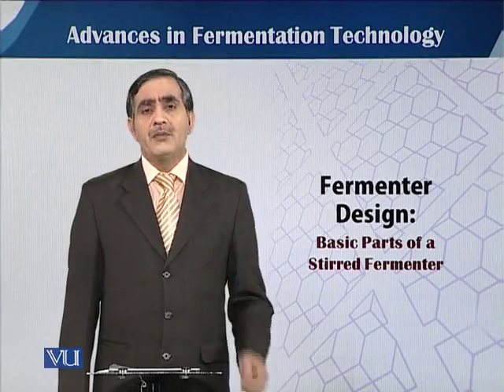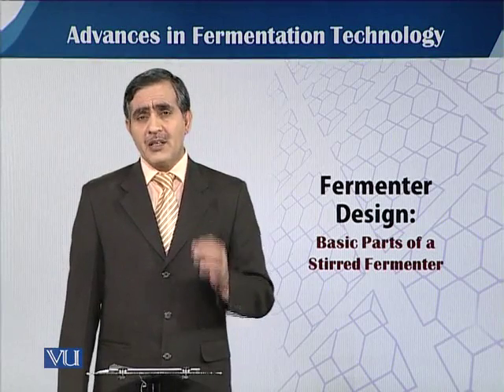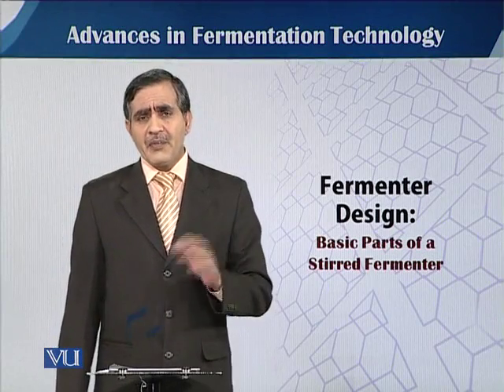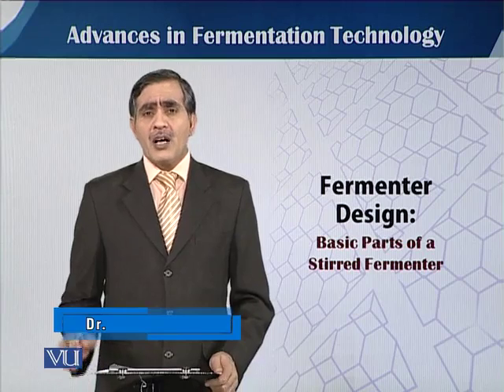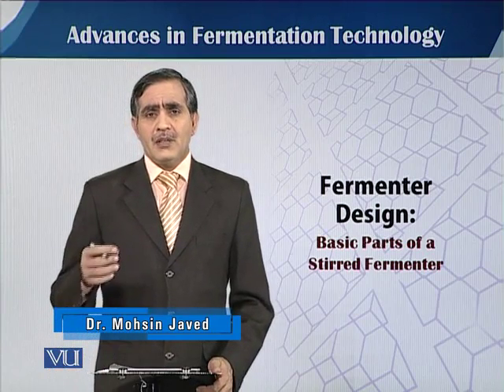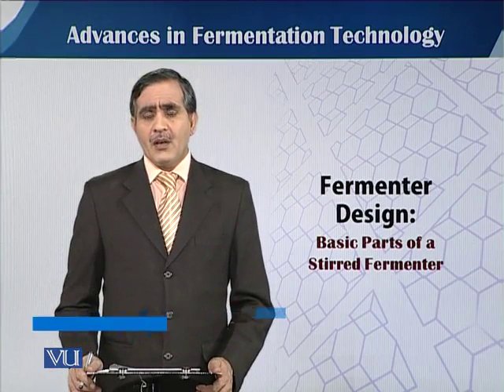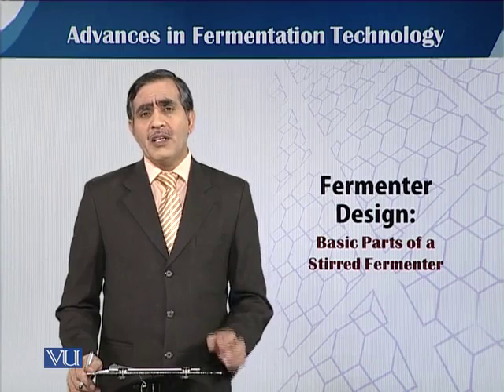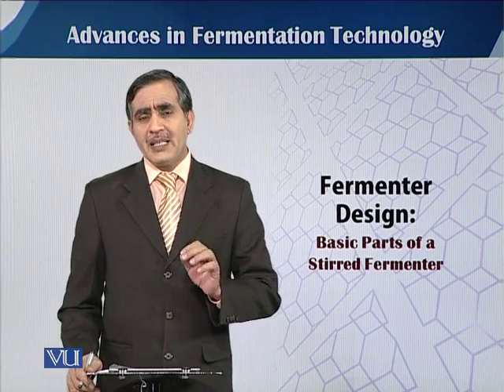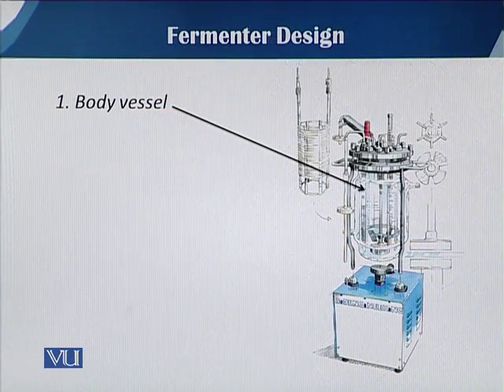In this module, we will talk about the basic parts of a fermenter, actually the stirred fermenter. In our previous module, we talked about 7 different systems that should be part of any fermenter. So, in this module, we will talk only about the basic parts in a stirred fermenter. So, the first basic part is the body vessel.